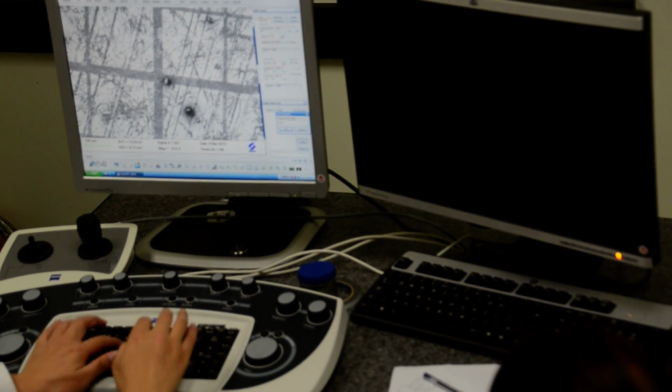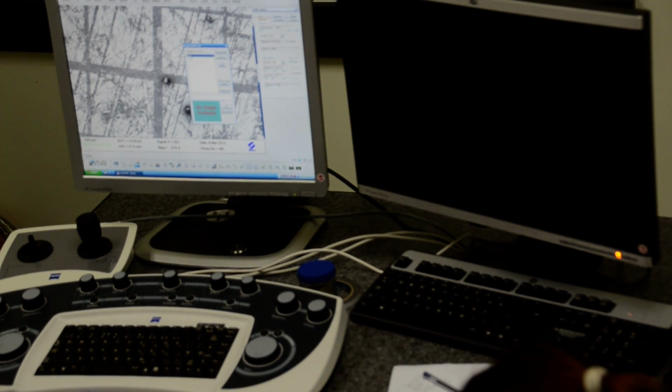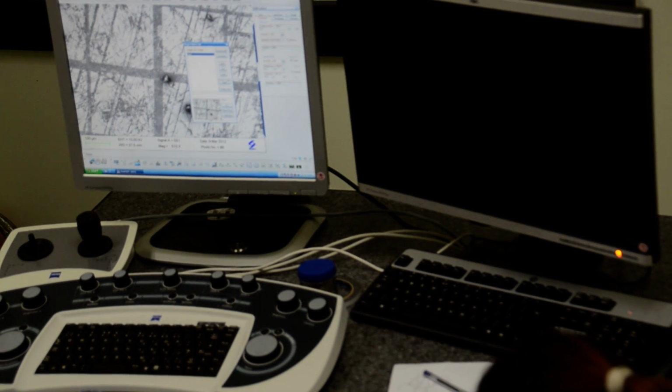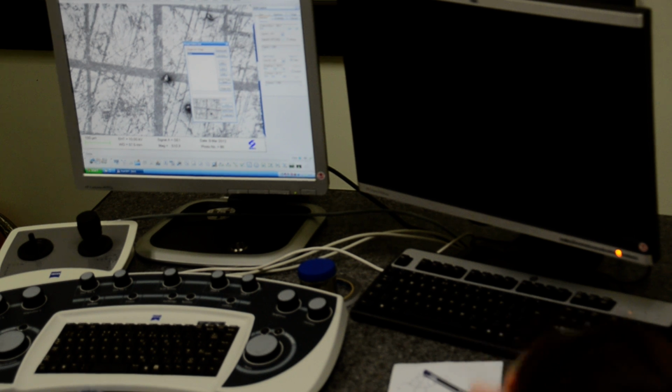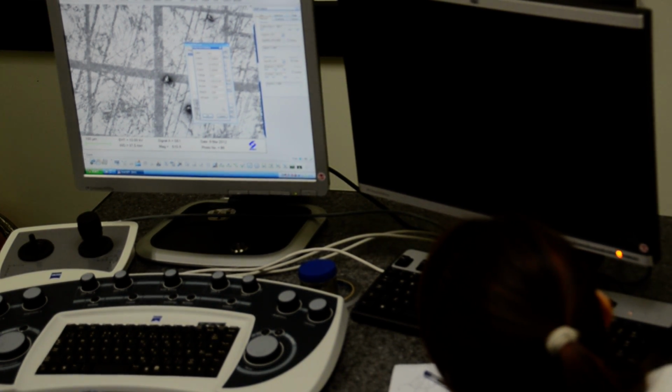I say a task. This will be saved, and there is a snapshot captured. And if you go there, you can take a look at this one. We save all the X, Y, Z, and all the conditions of that.